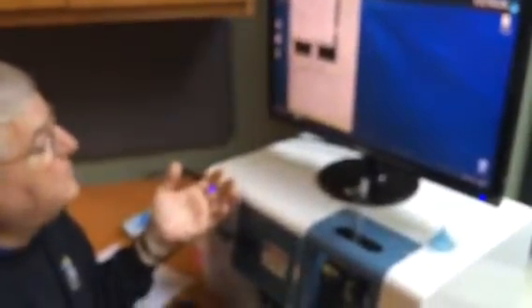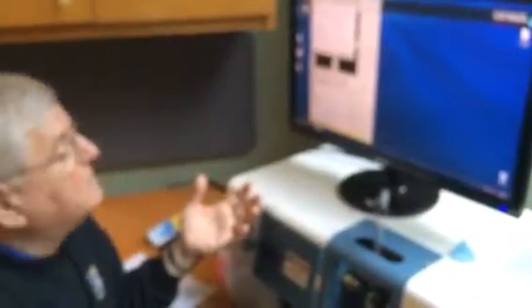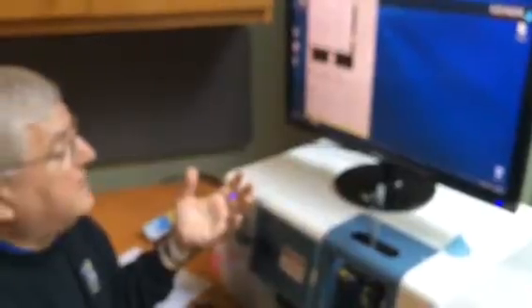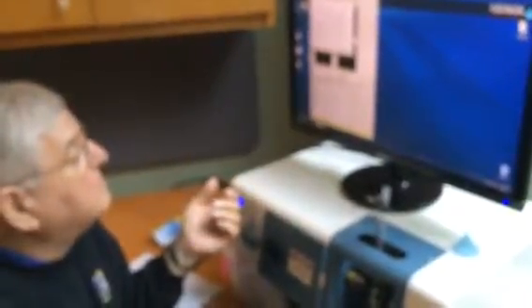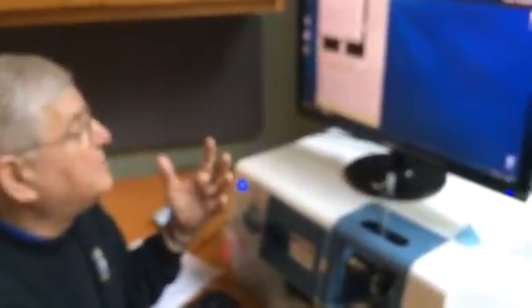What we're looking at here is what do we believe is the distance to the nearest neighbor object in microns? We're looking at our 5-micron algae, and we're looking for possible invasives. We want to see something, give it some room, so I would say 5 microns. We could even do 2 on this one, a little bit lower, because we know that the sample is extremely concentrated. So 5 would be okay, but 2, because it's concentrated, it's going to be closer.